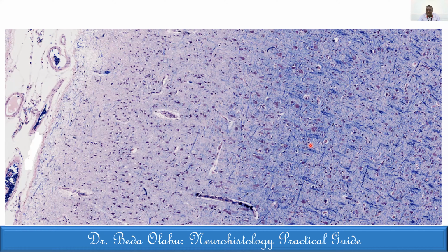The other important thing to mention is the fibers that she's talked about, the ones that tend to stain blue. Those are axonal fibers coming in. So that confirms to you again that you are in the central nervous system. Now we can add something more that confirms that this is actually cerebral cortex. One is just the cellularity. The fact that it's highly cellular means the cortex. Remember, cortex is highly cellular, and the cells are in changing transitions of shapes or sizes of cells.